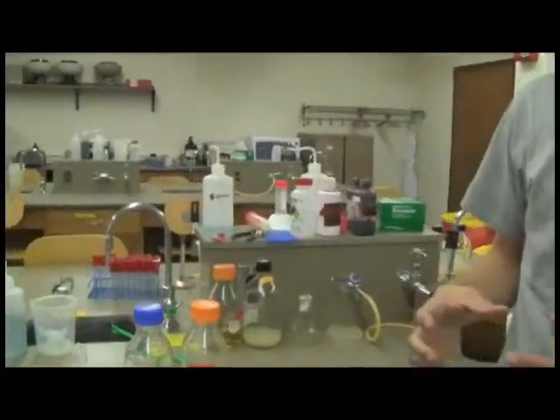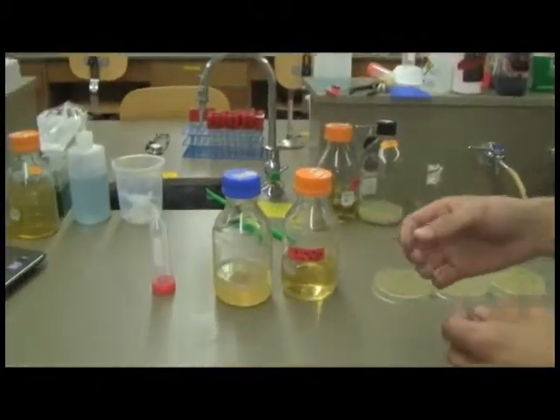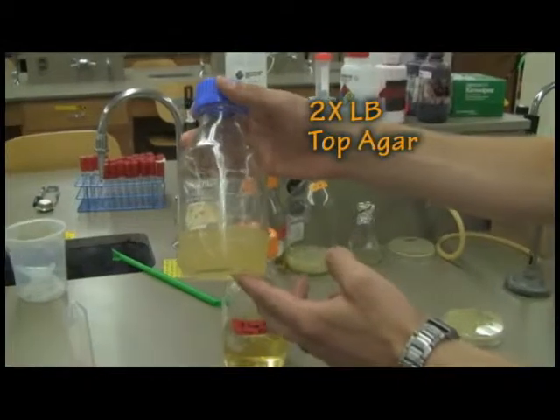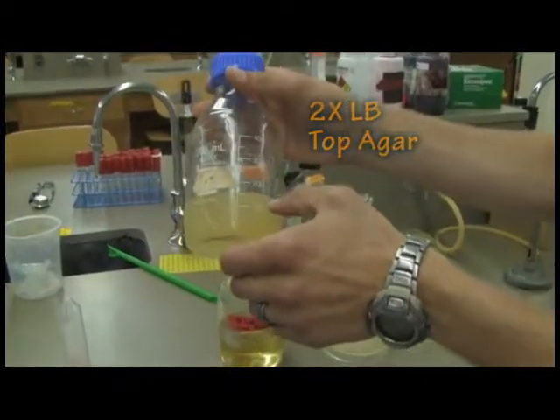So we use top agar when we work with our bacteriophage because top agar allows us to mix the bacteria and the phage together and then spread it out on a plate and allow us to see the results. What we usually do is we'll make top agar that's twice the concentration we typically use it at and allow it to solidify at room temperature for storage.